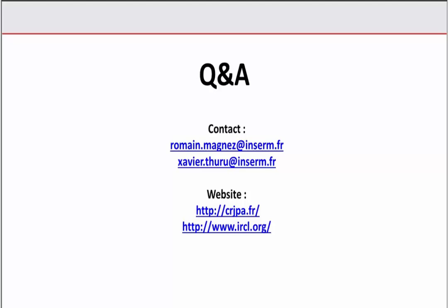Thank you. Our next question: do you plan on screening chemical libraries on PD-1 and PD-L1 using MST? So we thought about that, but basically the whole process is to develop new molecules based on the structure of the molecule we previously screened. So we are not going to screen a new library, but we are going to develop, with structure-activity relationship, new molecules to make the affinity of our molecule better. So this is not the point to screen a new library now, but to perform a new synthesis and a new drug design for the molecules we are trying to investigate.